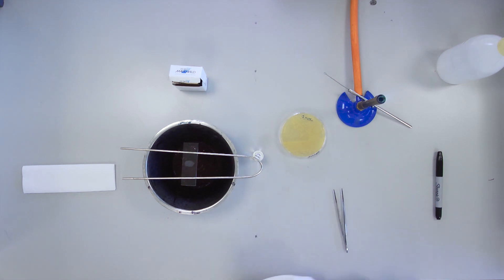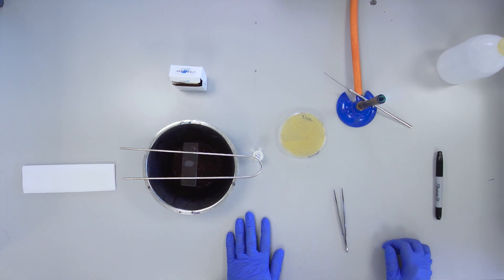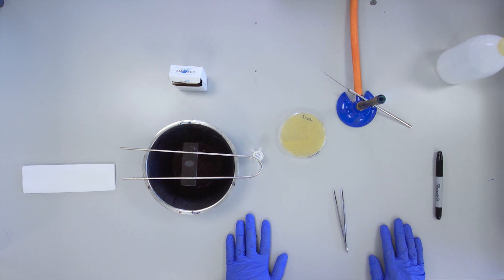The heat fixed smear is now ready for staining. It is possible to prepare multiple slides simultaneously, providing you label all slides well.